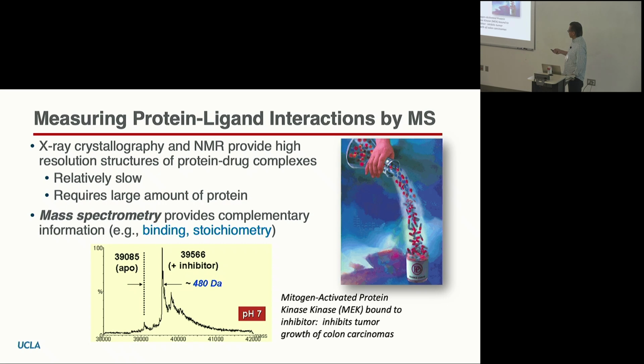In a drug company, they would then want to get the 3-dimensional structure of the ligand protein complex, and so we can tell the crystallographers and the NMR groups, yep, you should focus on this drug protein combination and spend all your time trying to solve the structure. So that's what we were doing back in the old days when I was working at Pfizer.